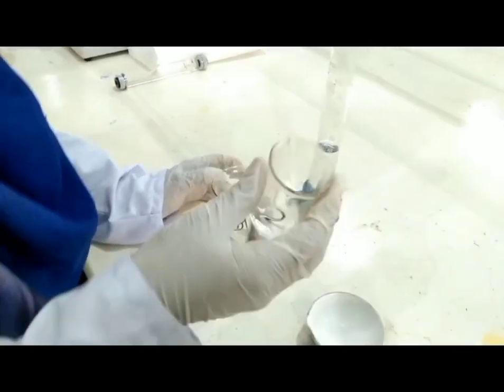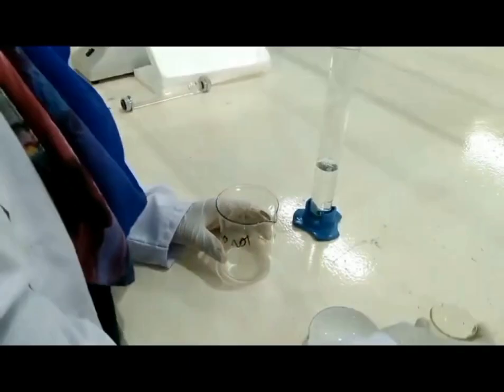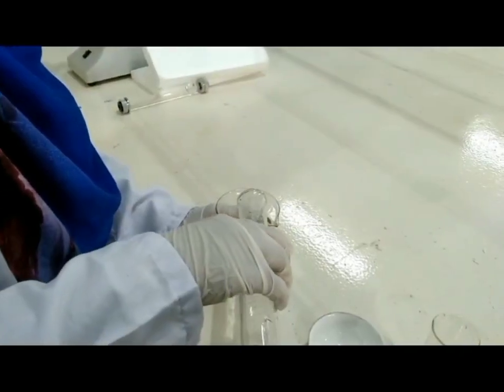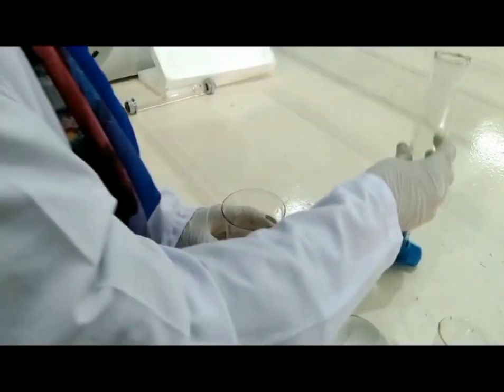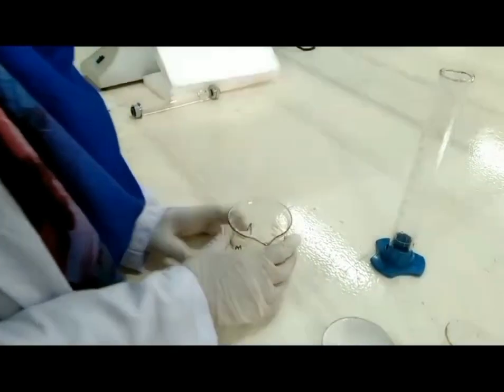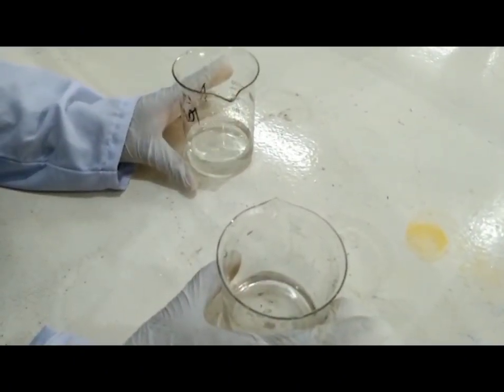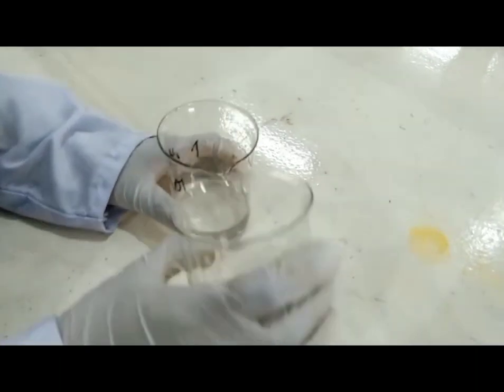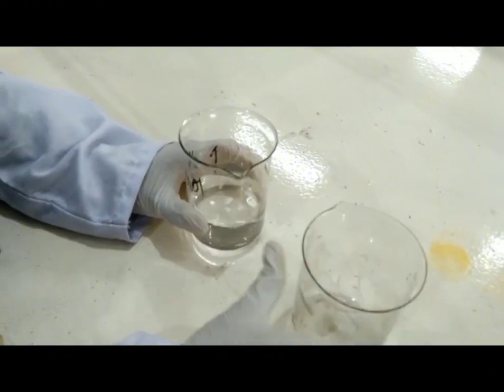Add 3.67 HCl in the beaker. Add 50 ml water in it. After that, we mix both the solutions. Add the HCl solution to the sugar solution and mix it.